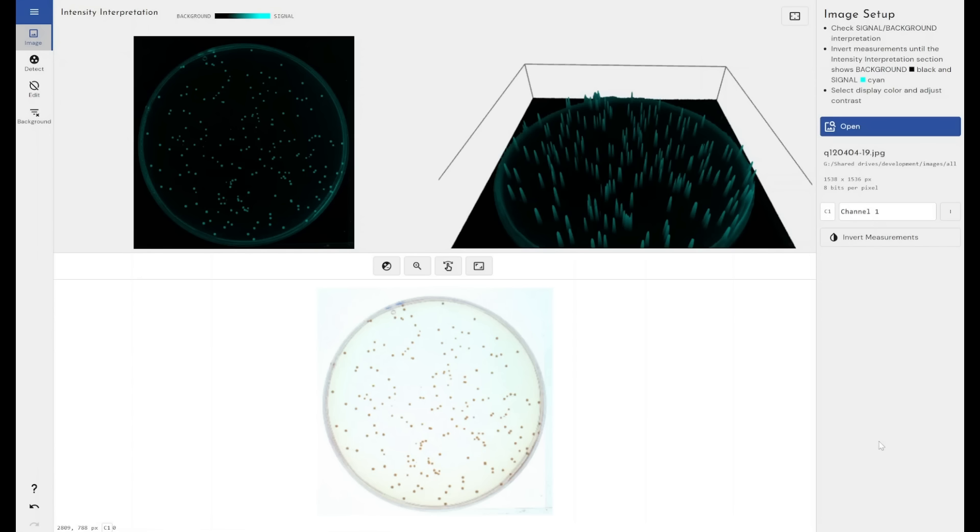If you've used any of our other Phoretix modules of image analysis software, you'll recognize this screen. This is the image setup screen. I brought in this image and it's not the world's best quality image. It's a JPEG image, so it's been compressed and it's only got a bit depth of eight bits per pixel.